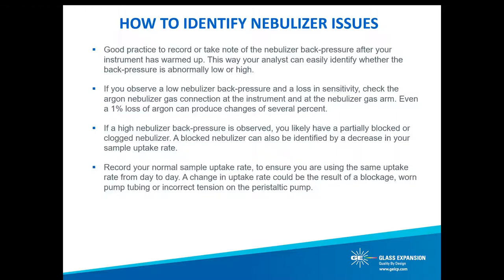Glass Expansion's Direct Connect concentric nebulizers run optimally at, for example, 40 PSI. If you observe a low nebulizer back pressure and a loss in sensitivity, check the nebulizer gas connection at the instrument itself or at the nebulizer gas arm. Other nebulizer models might use a PVC or polymer tube to supply gas to the nebulizer — these can harden over time, lose their flexibility, or lose their gas-tight grip. Even a 1% loss of argon flow can produce changes of several percent with many ICP analytical lines, and you want to maintain a constant nebulizer back pressure for a constant steady signal. If a nebulizer has a high back pressure, you likely have a partially blocked or clogged nebulizer.